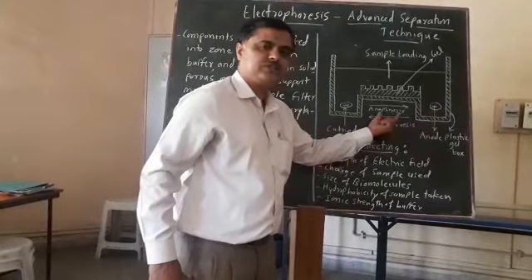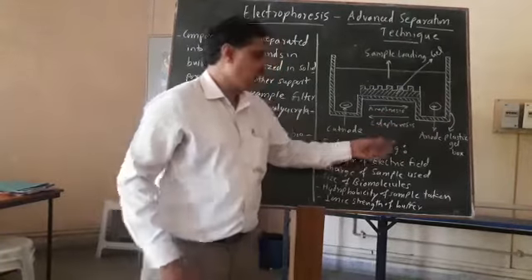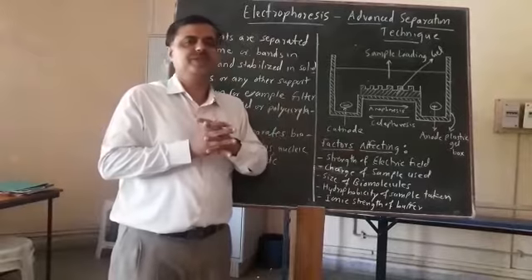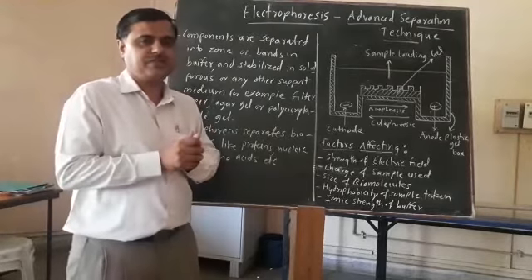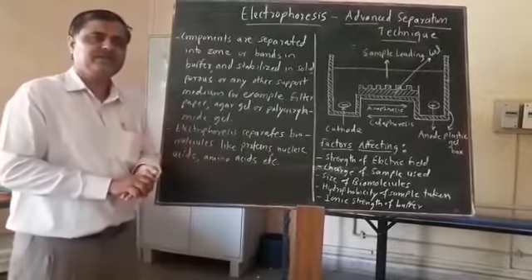That is, the first one is anaphoresis and the second one is cataphoresis, and we have seen the various factors which affect the performance of the electrophoresis process and the degree of separation of the different components. With this I stop.